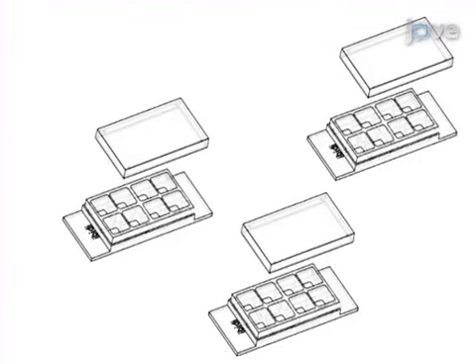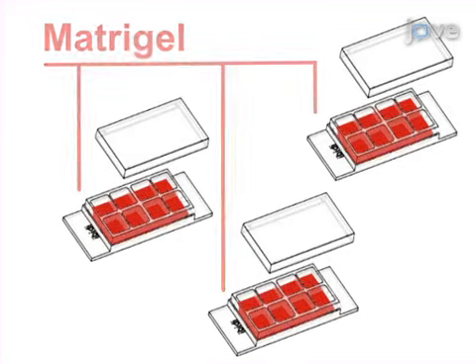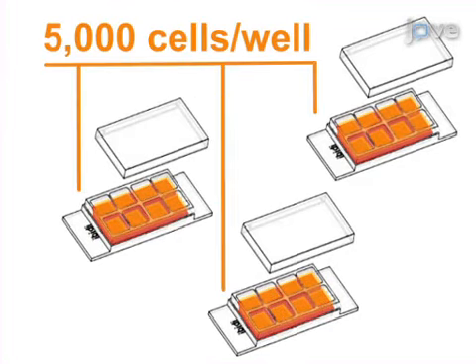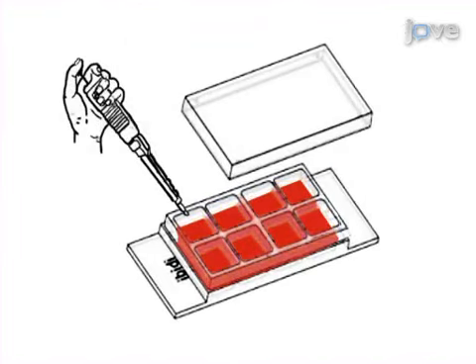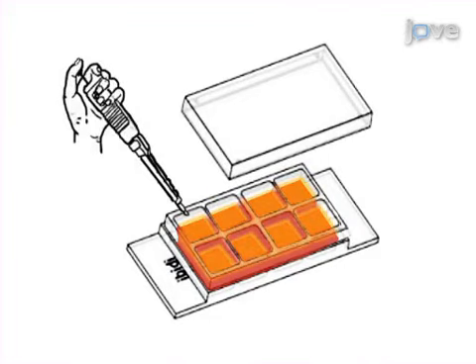This is accomplished by first plating the control and experimental cells in triplicates on a layer of growth factor-reduced Matrigel in an 8-well chamber slide. The second step is to give fresh complete media changes with 2% GFR Matrigel every 4th day, allowing the acinar-like colonies to grow for 10 to 15 days.